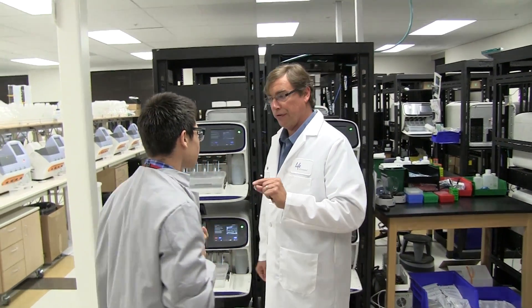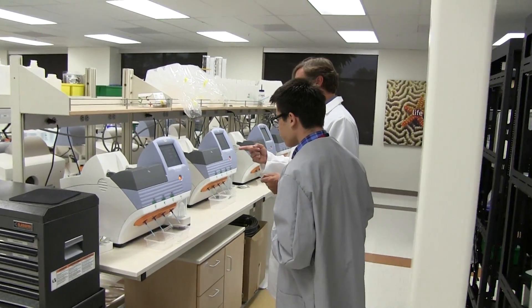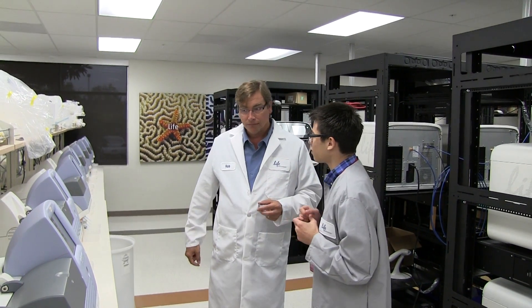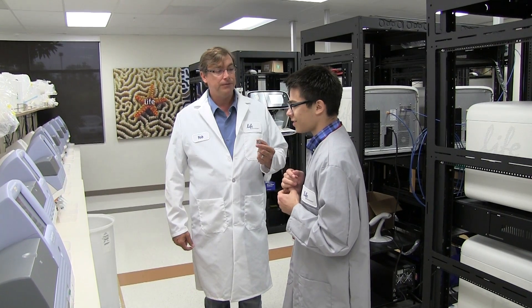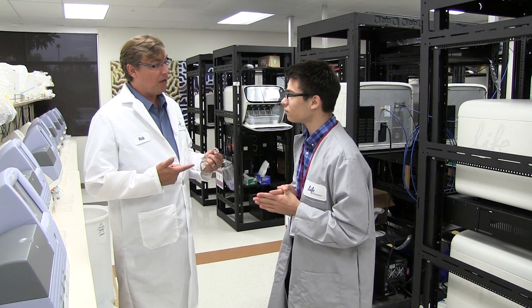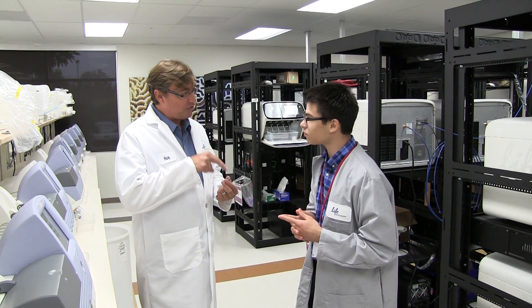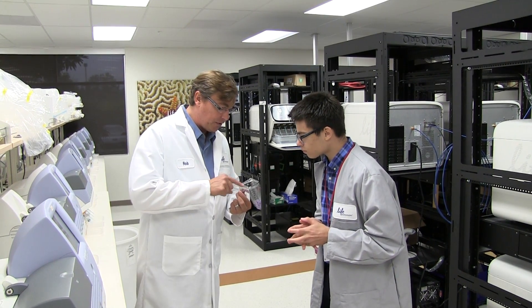This chip runs on what we call the Personal Genome Machine — that's this machine here. The diameter of each well is around a micron. We use the same type of manufacturing processes that make semiconductor chips, and we etch the wells into this chip. Then we put a flow cell on top so liquid can flow across.